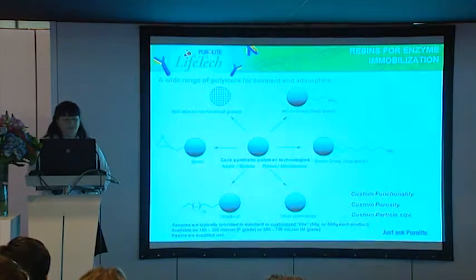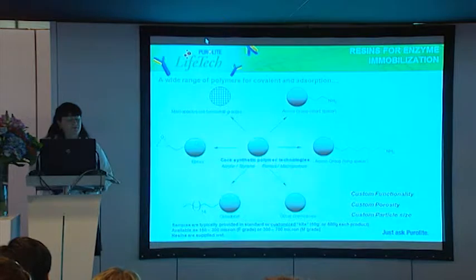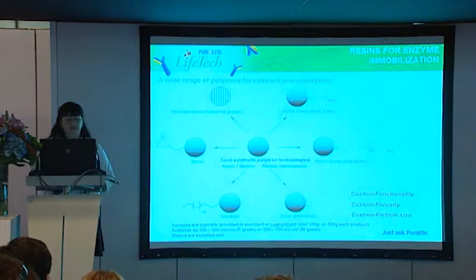the reactions. We have also different kinds of resins functionalized with octadecyl. So here you exploit the matrix, which can be styrene or acrylic, and then you have different pendants, different loadings on pendants, so C18 on the resin, that favor the absorption of the enzyme. And then we have a panel of resins for covalent immobilization, so the amino resins, where you need to pre-activate with glutaraldehyde, and the epoxy.